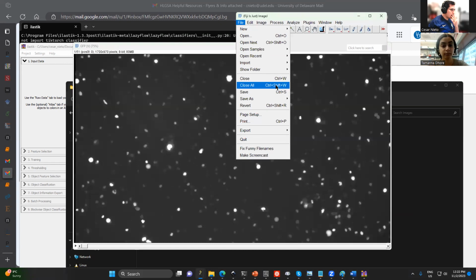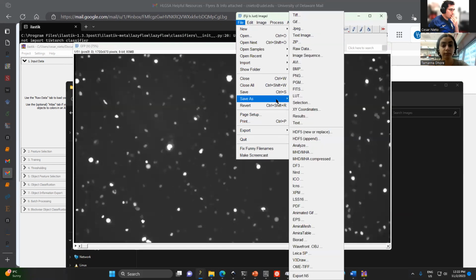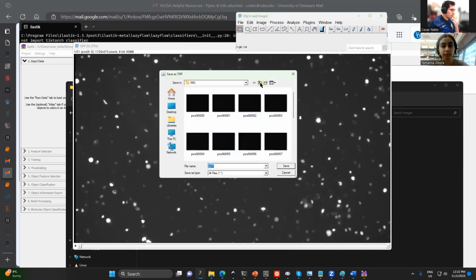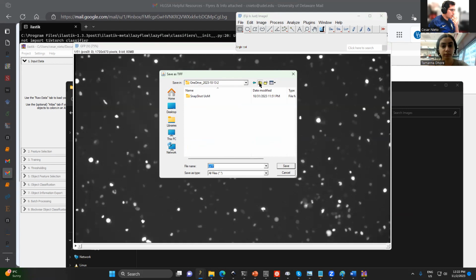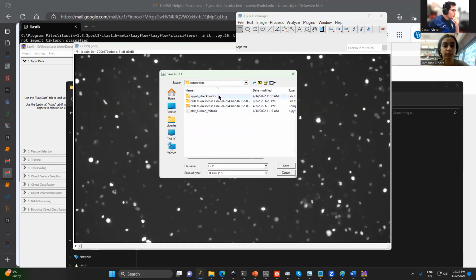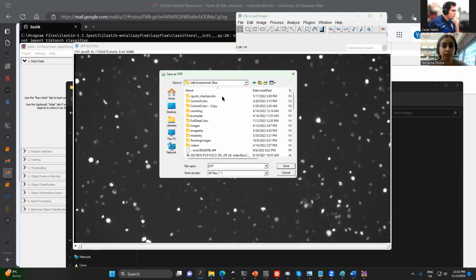So it seems that this guy is defined. We're here, no?